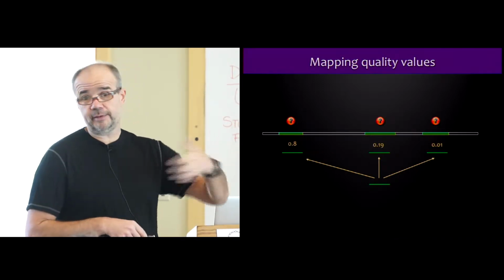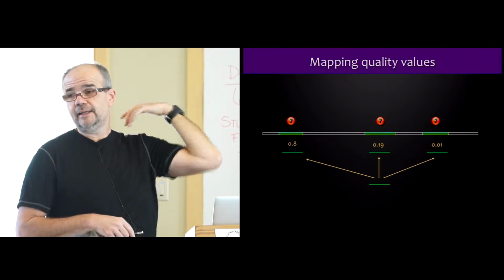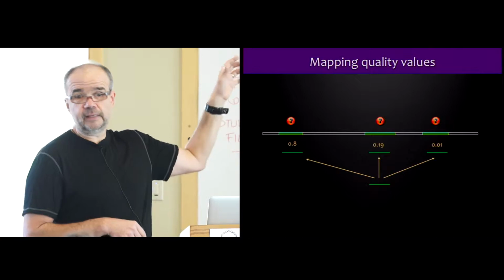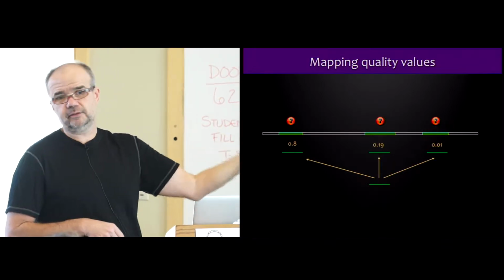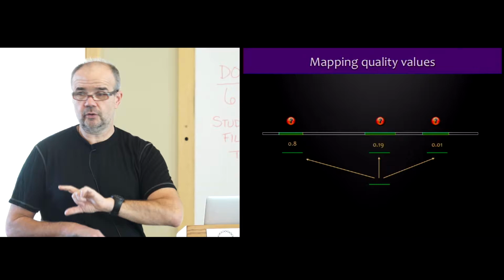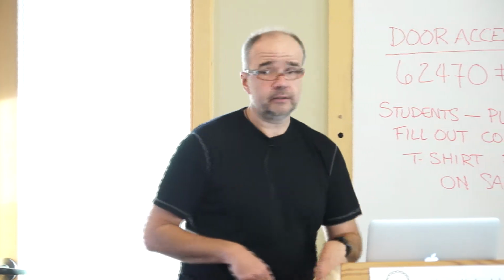Not in probability space, it's basically, if you place a read, for example, here, the mapping quality value gives you the 10 base logarithm of the likelihood that that place was incorrectly placed. Okay? Similar to base quality values that give you a logarithmic likelihood that the base is not what you called it, etc.